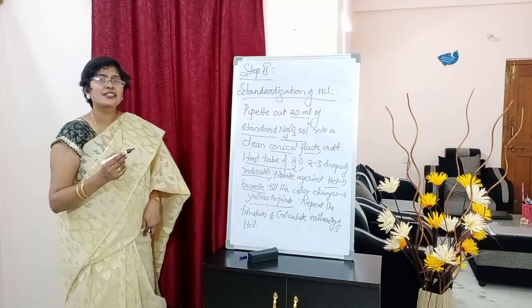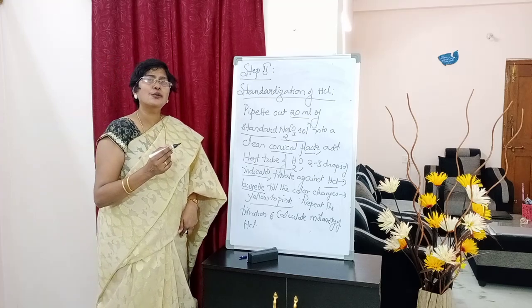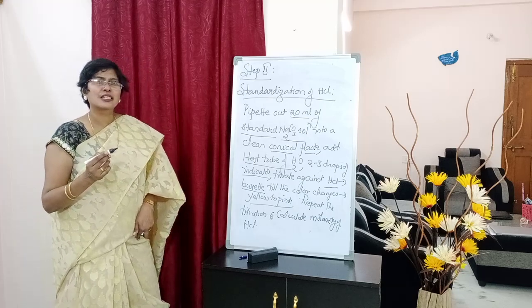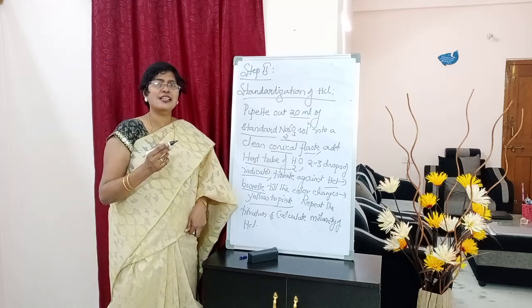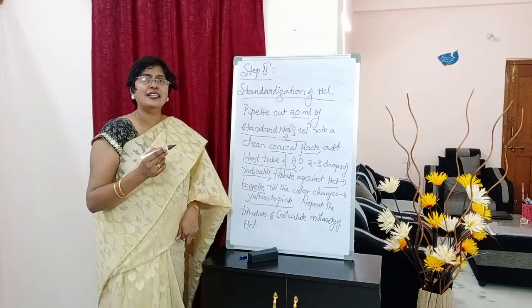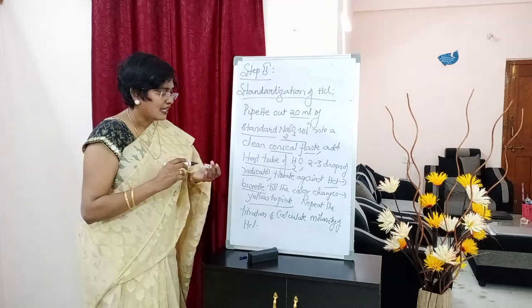Repeat the titration and calculate molarity of HCl.